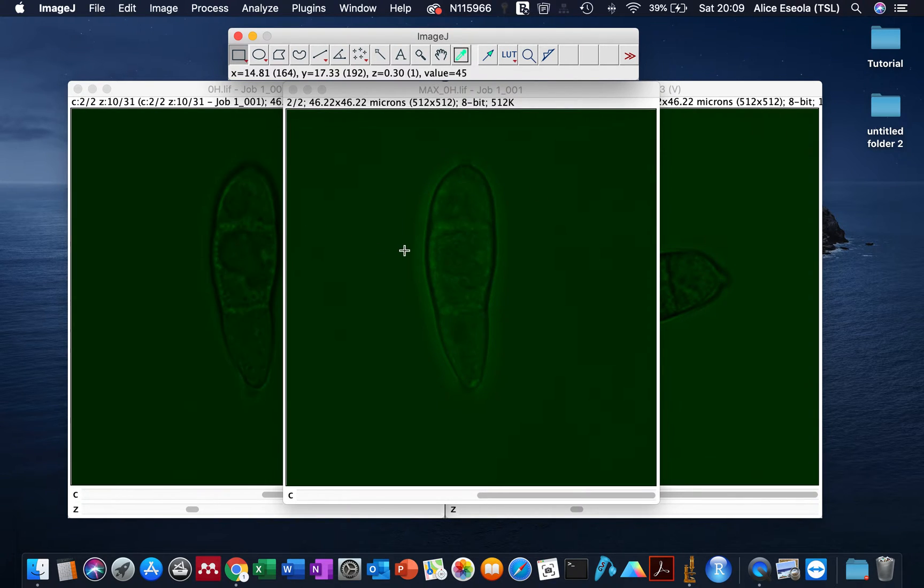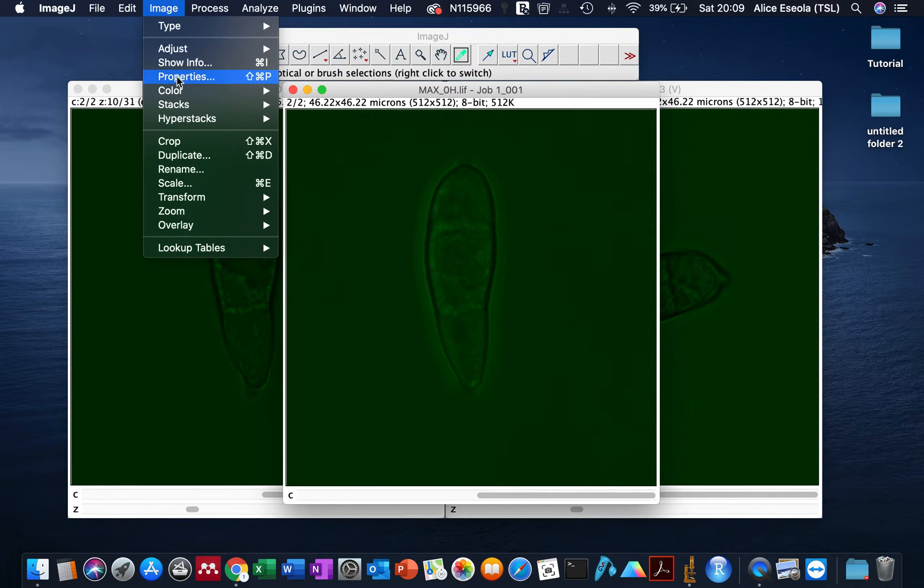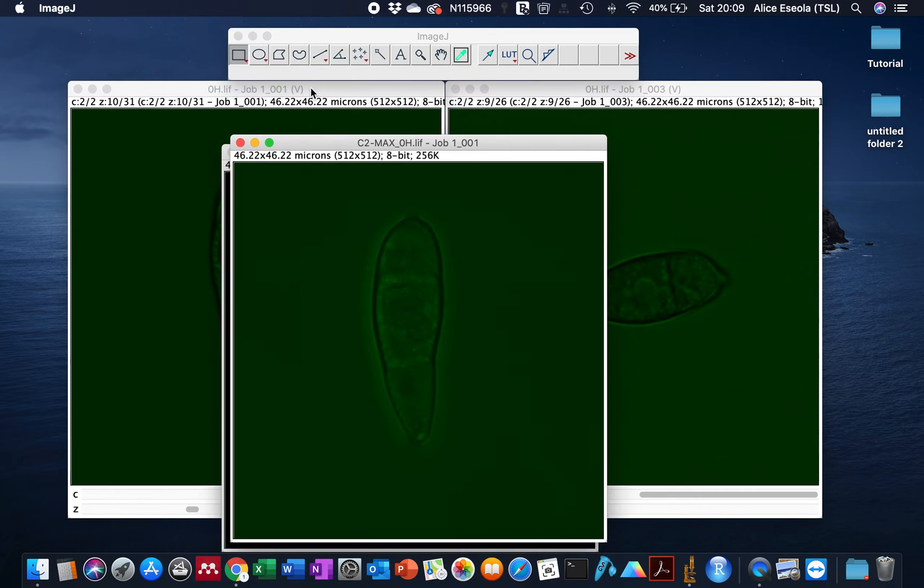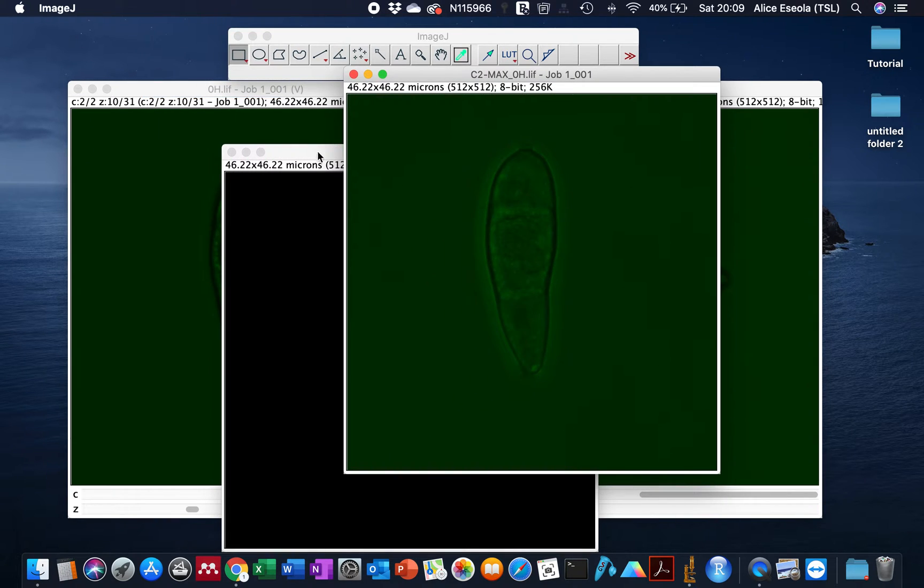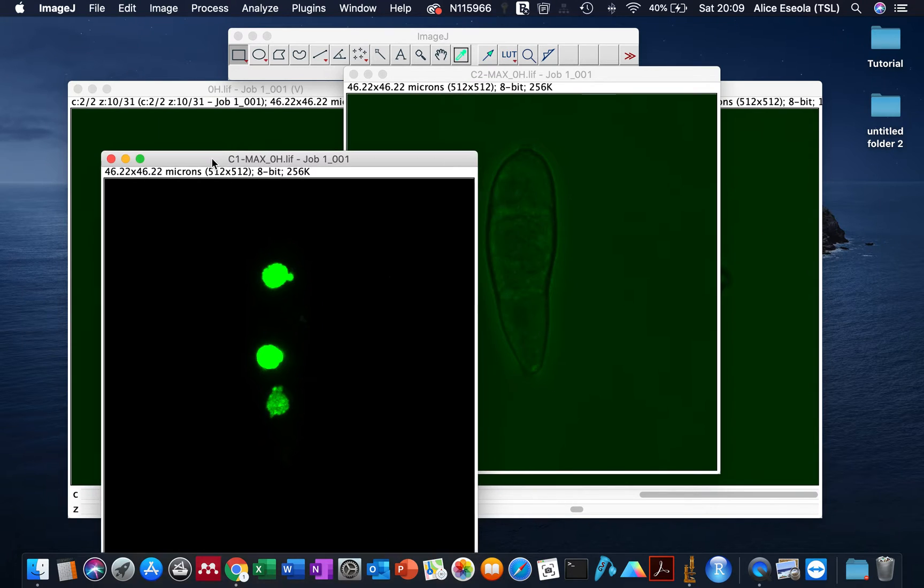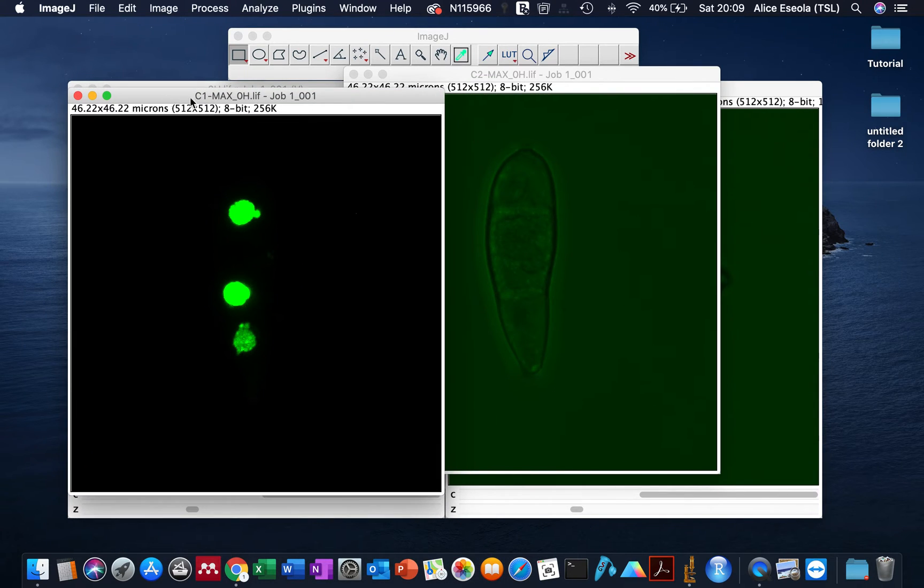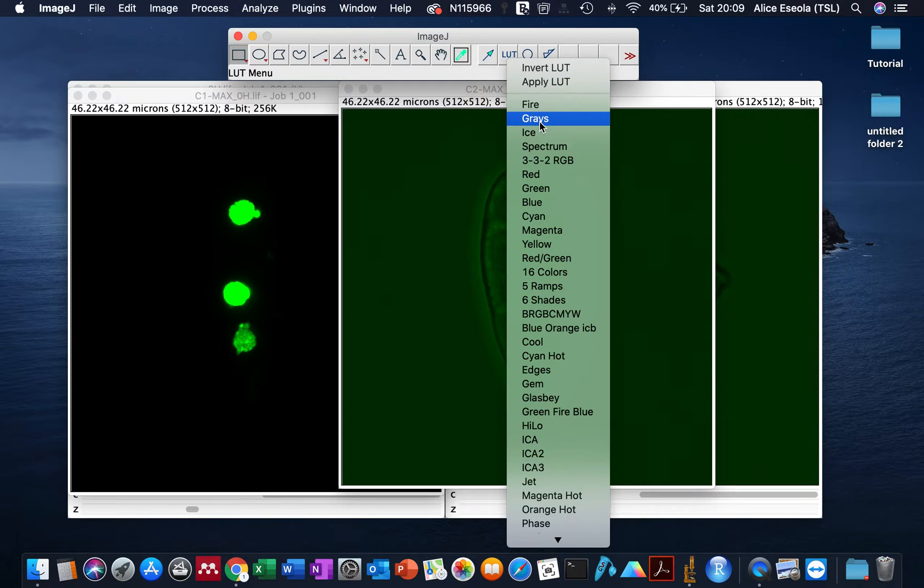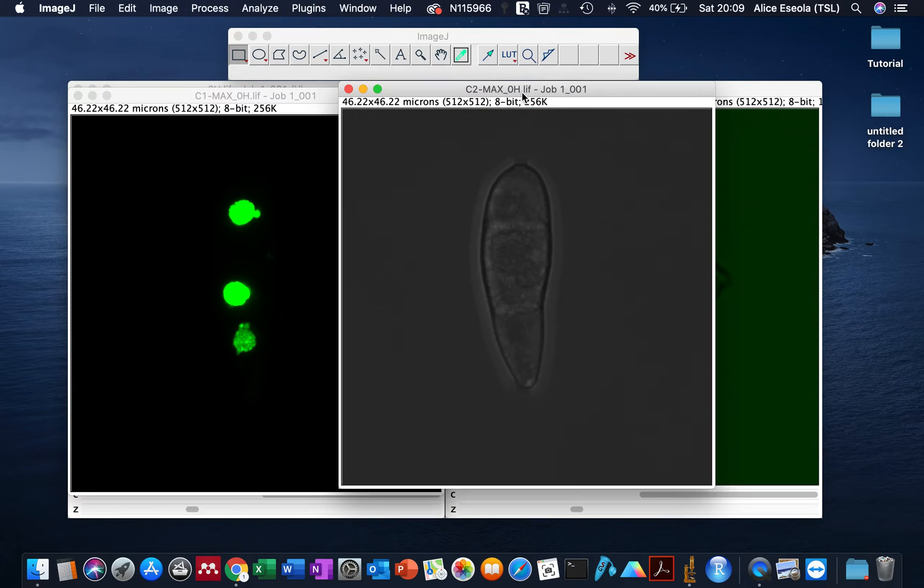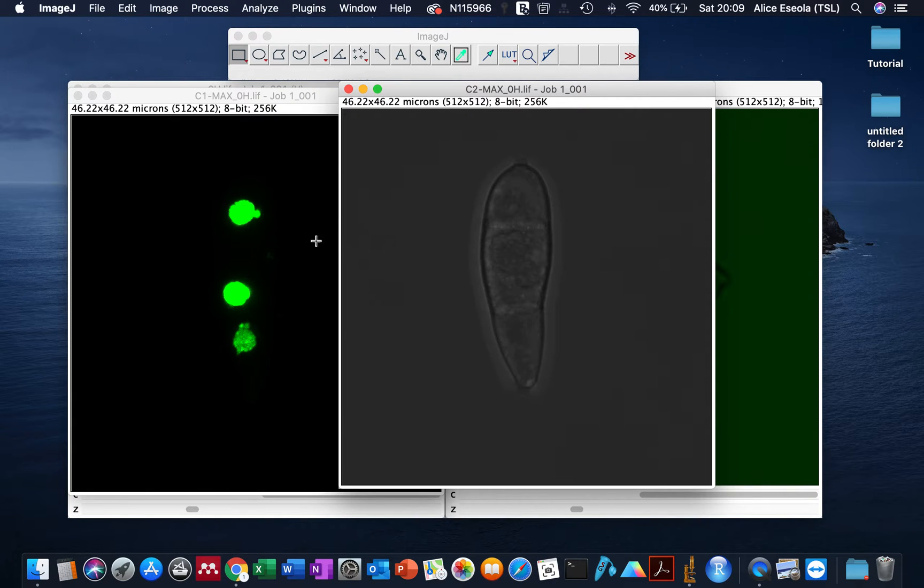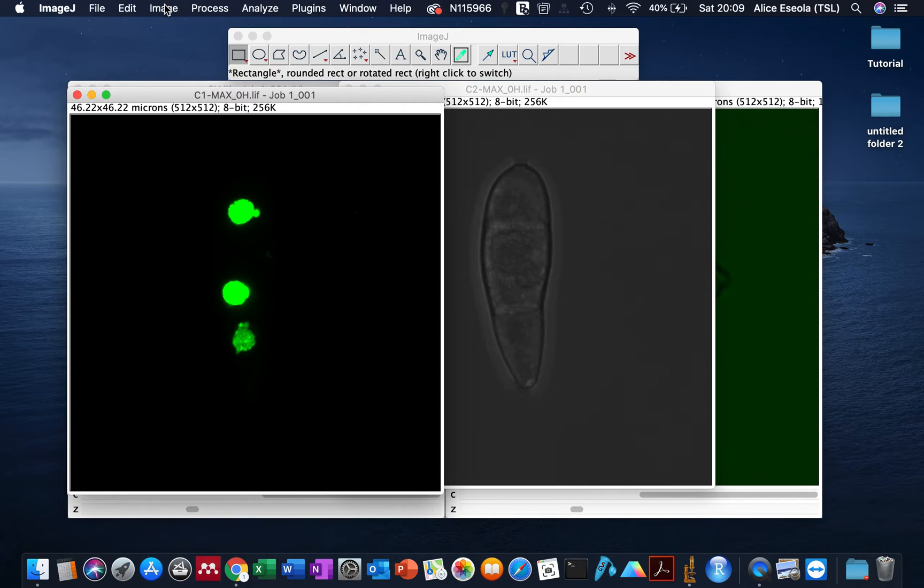The bright field channel has also been changed to green. We can resolve this by splitting the image. We go to Color, Split Channel. Here we have our bright field and our fluorescence field. For the bright field channel we can change it back to gray color. If you want them matched together without either channel affecting the color, go to Image, Color, Merge Channels.